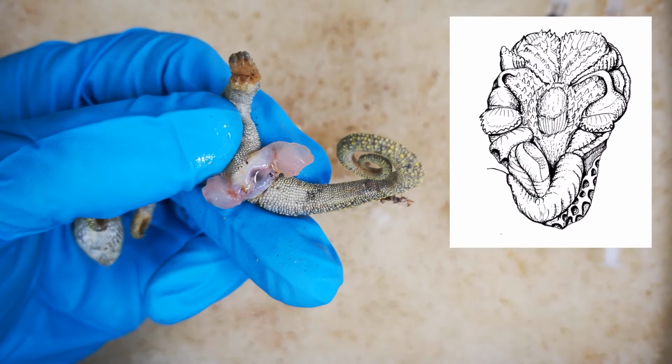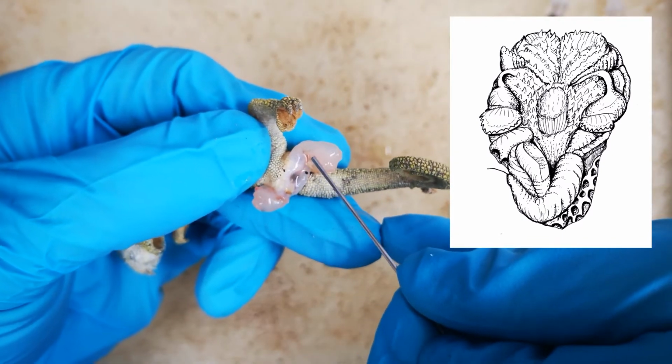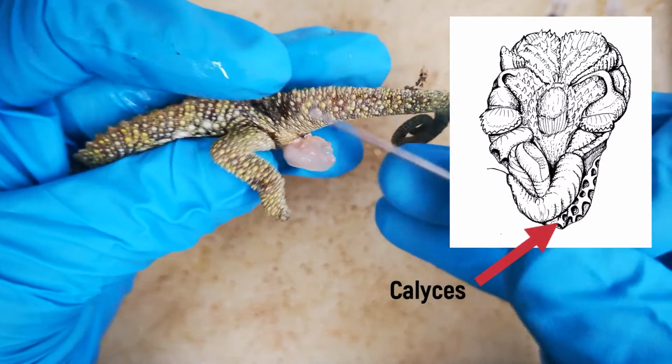Now you can examine the surface structures of the hemipenes. The rotulae are visible toward the asulcal edge of the distal tip of the hemipenis. Here, on the left hemipenis, we can see the asulcal surface. In many species, it is covered in calices, a network of ridges that have a honeycomb-like structure.